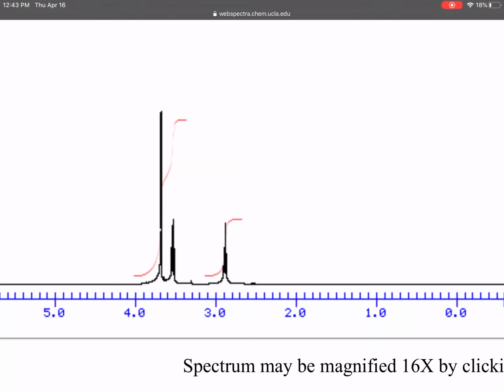If I'm looking at this closely and I estimate here where one ends and the other begins, it looks to me that those are 2 S curves that are about the same size. So I'm going to say, going from left to right, A to B to C, I think the first 2 are about the same. And then the third one is, I would say, a little smaller than each one of those. I would say the S curves for the first 2 are probably about 1.5 times as big.